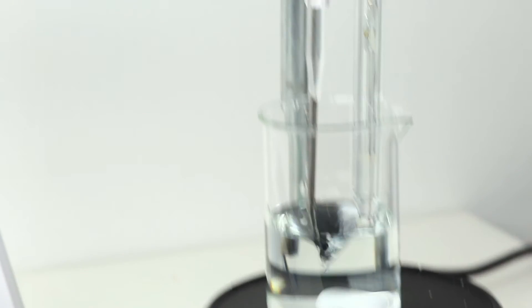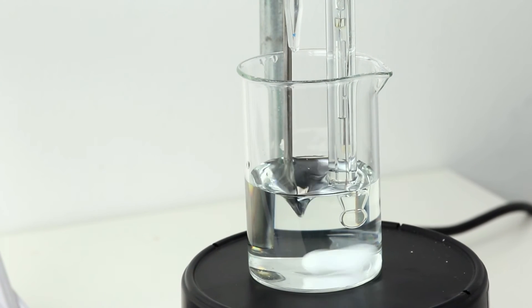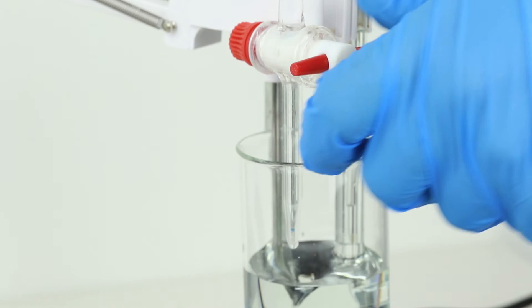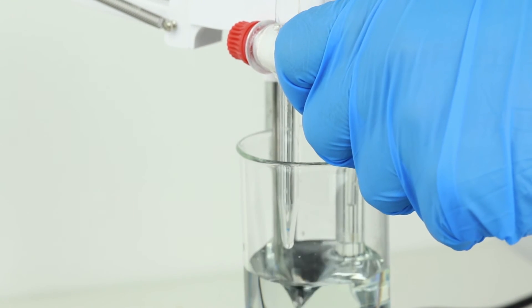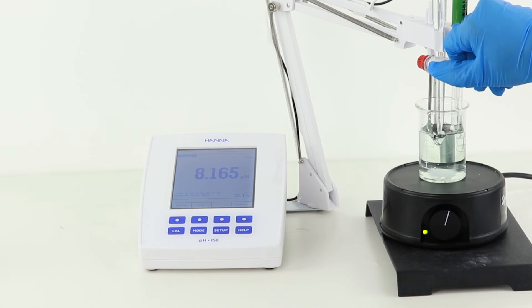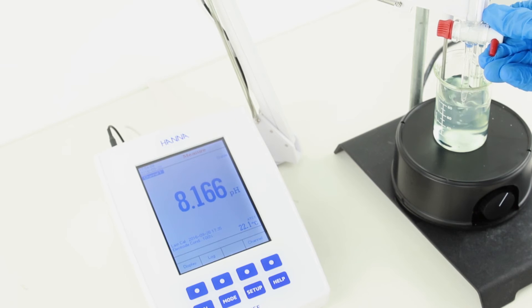Now, we can begin titrating with the sodium hydroxide titrant to the endpoint of pH 8.2. We do this by opening the stopcock to dispense the titrant. We'll add the titrant in larger quantities in the beginning and slow down as we approach the endpoint. The titration is complete when the pH meter displays pH 8.2.